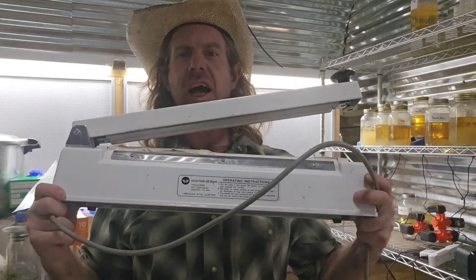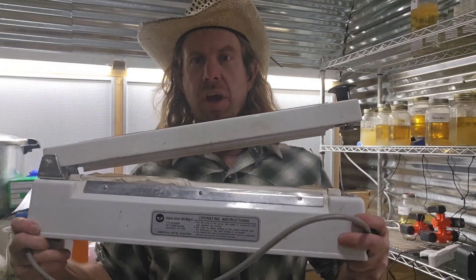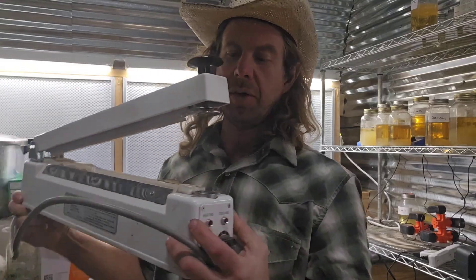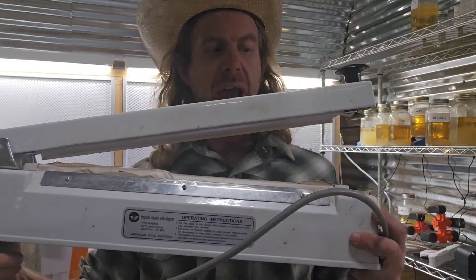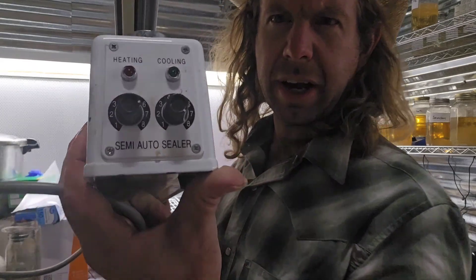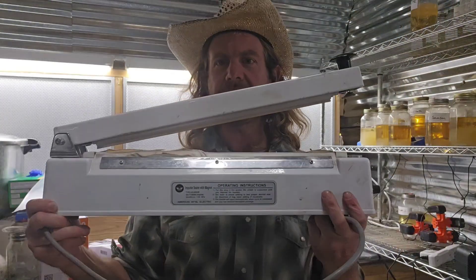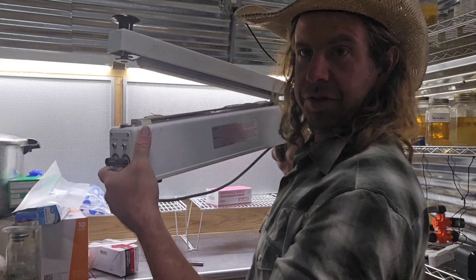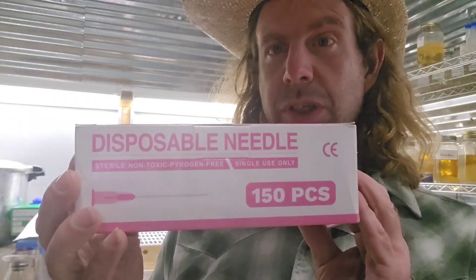Number twenty-nine: an impulse sealer. This is actually a magnetic impulse sealer — I use this to seal all my mycology bags. When you shut it, a magnet holds it down, the little heating filament heats up, it seals the bag, the timer goes down, you can adjust the heating and the cooling, it releases the magnet, and you've got a nice sealed bag. Number twenty-nine: everyone needs an impulse sealer.